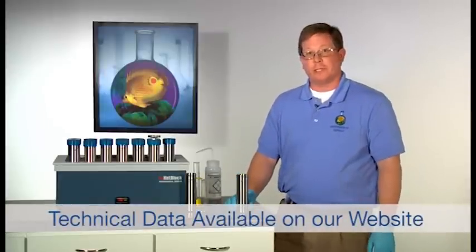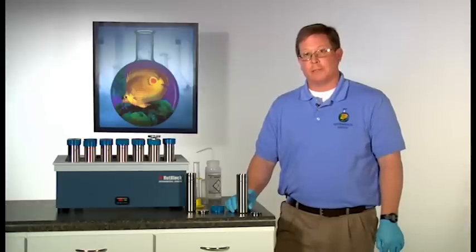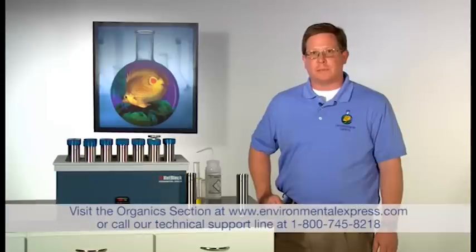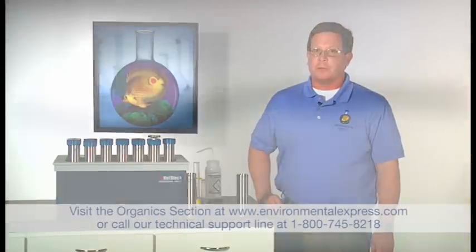The sample is now ready for filtration, concentration, clean-up, and analysis. Thank you for taking the time to watch Environmental Express Tech Tips on the Soil Cell System. We appreciate the opportunity to earn your business.